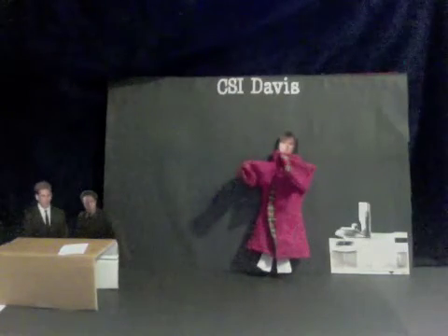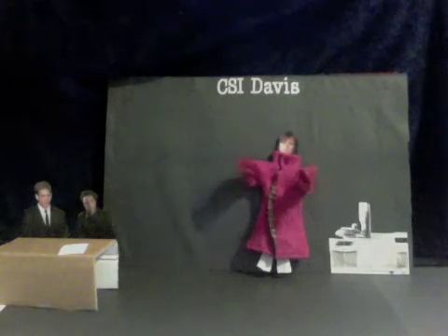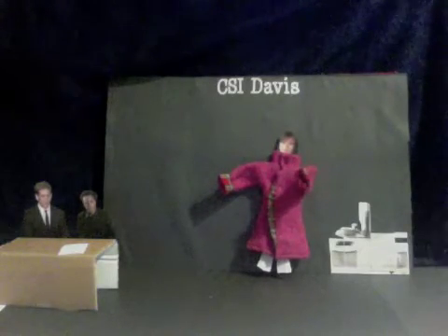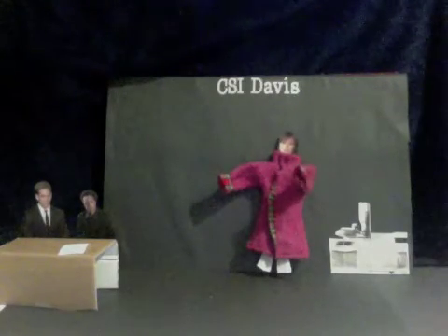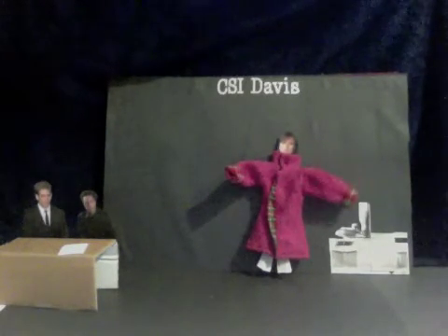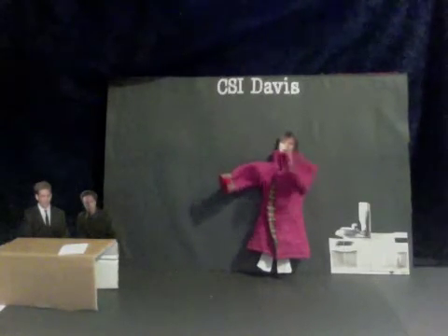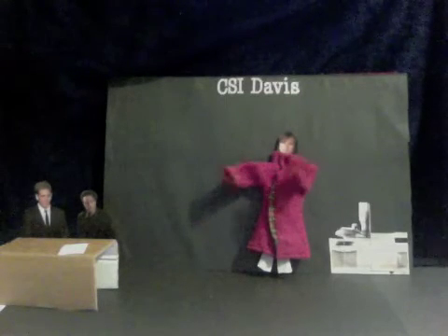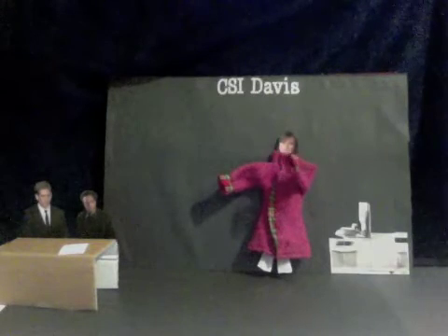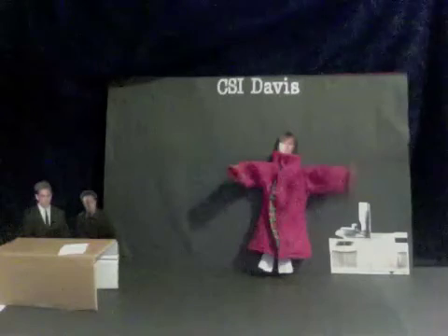I have an idea. I am going to cut the work order into two parts, the date and the rest of the document. Then, I'm going to cut these two parts into smaller pieces and dissolve them using solvent. Then, I'm going to load them into the GCMS, this machine you see right here. What's neat about the GCMS is that it combines gas chromatography, the GC part, and mass spectrometry, the MS part. I will get the chemical formula of the ink used for the date portion and for the rest of the document from the GCMS results.